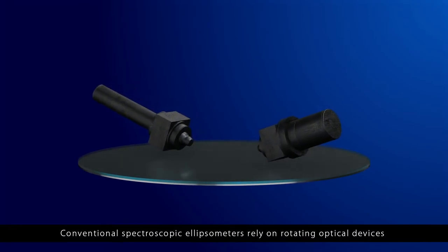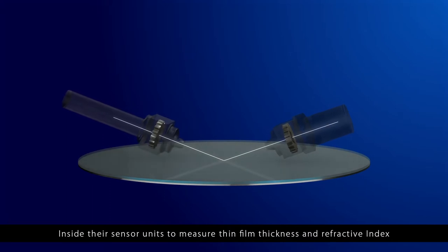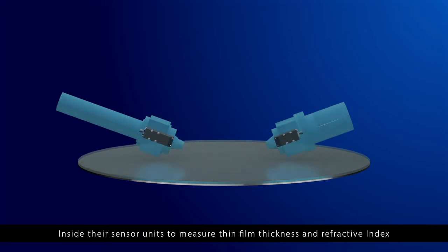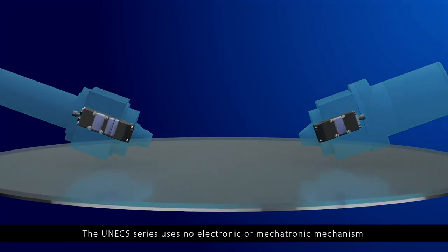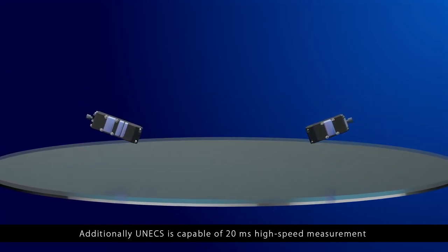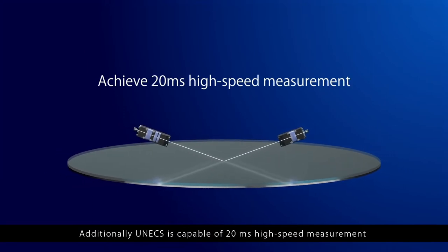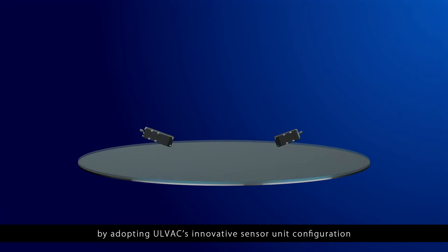Conventional spectroscopic ellipsometers rely on rotating optical devices inside their sensor units to measure thin film thickness and refractive index. The UNECS series uses no electronic or mechatronic mechanism, making them compact and maintenance-free. Additionally, UNECS is capable of 20 millisecond high-speed measurement by adopting ULVAC's innovative sensor unit configuration, which uses fixed optical devices only.